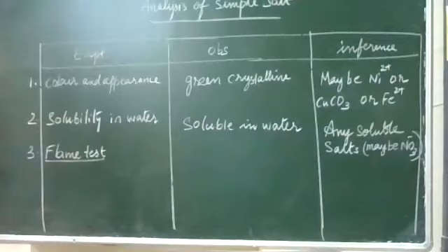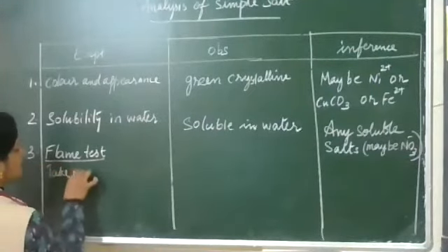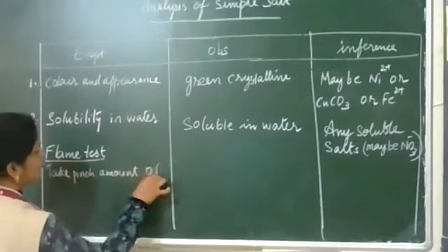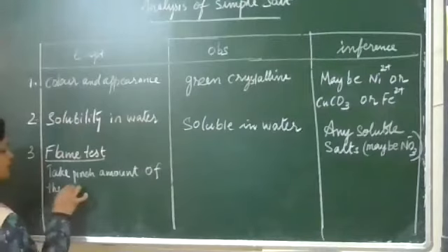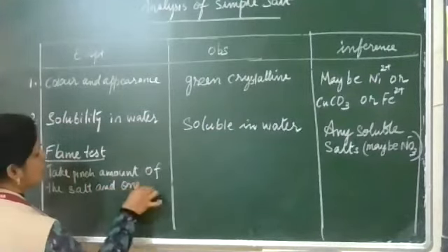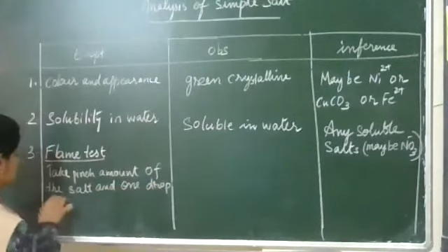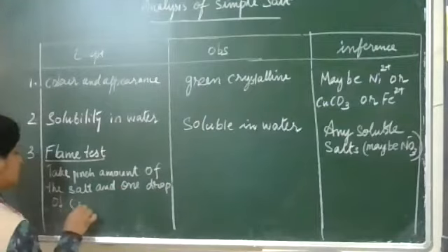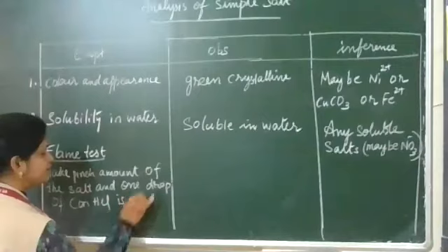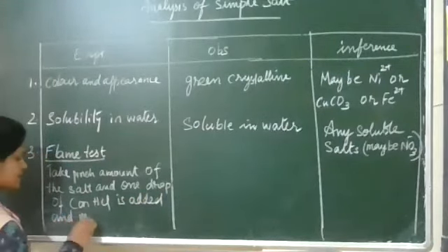So we write: a pinch of the salt and 1 drop of concentrated HCl added and made into a paste.